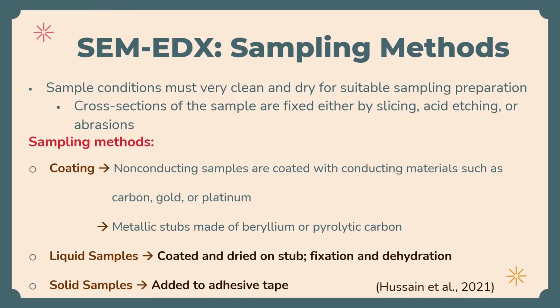For solid samples, these are a little bit easier types of samples, and a small sample is scattered on an adhesive tape.